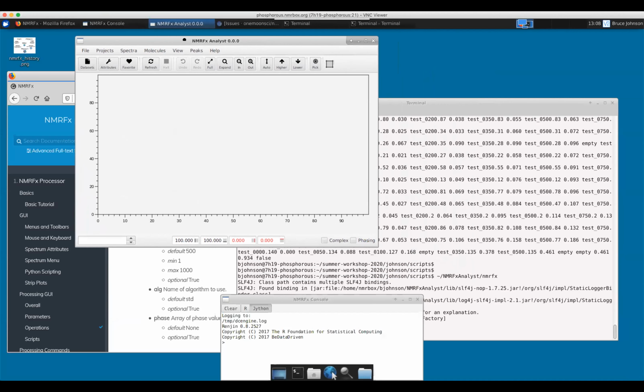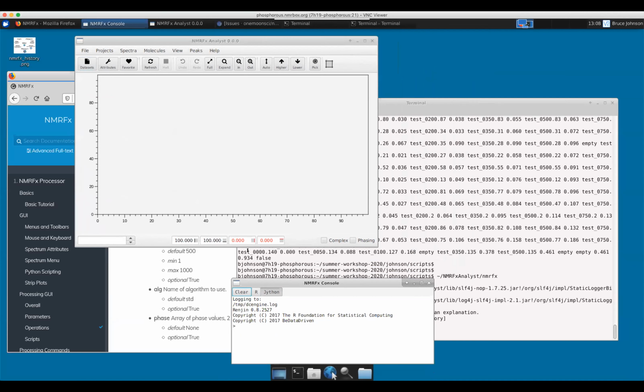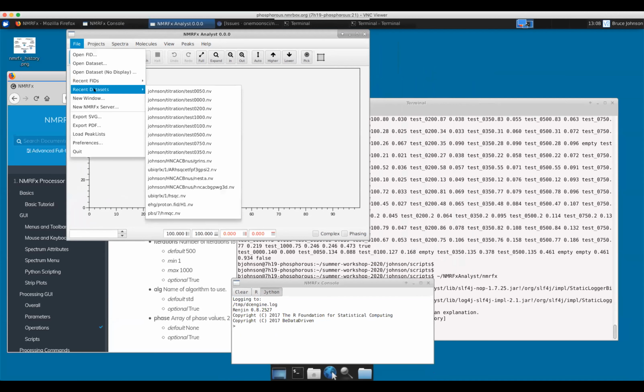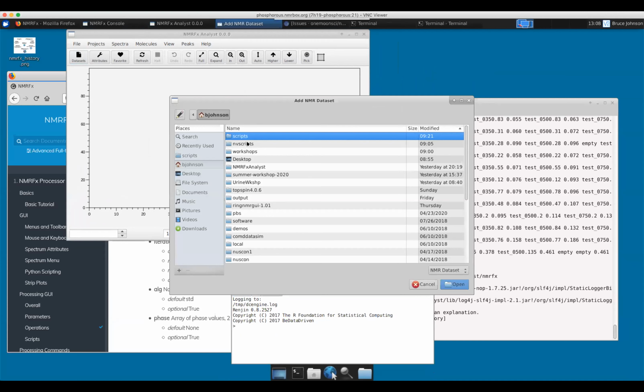I have a copy of the fixed version, but it's not pushed yet into the box. Basically, we made a change in the code a few weeks ago, and it changes updating all those menus of peak lists, and they're not updating when they should. So let's try this again. Like I say, you're just going to have to watch for this part.